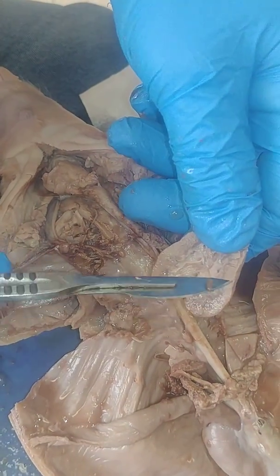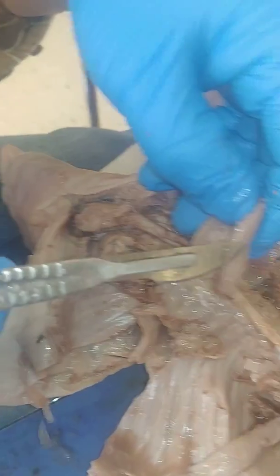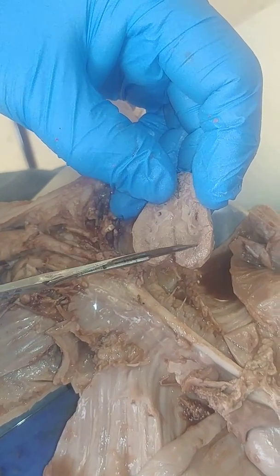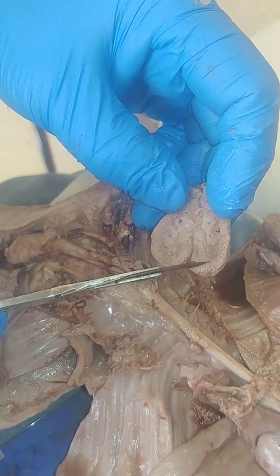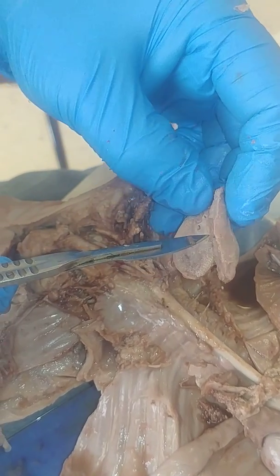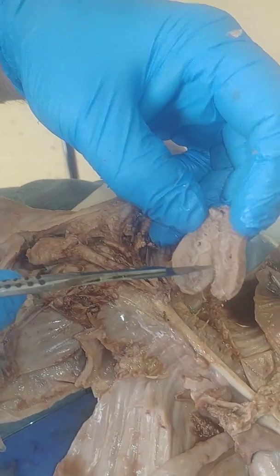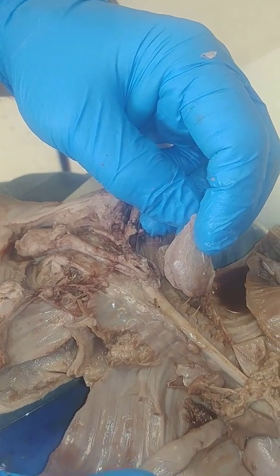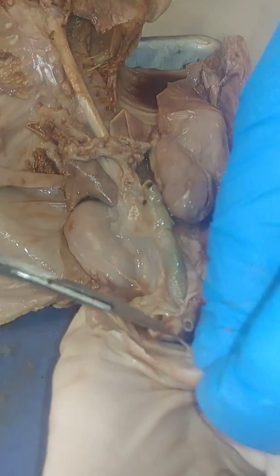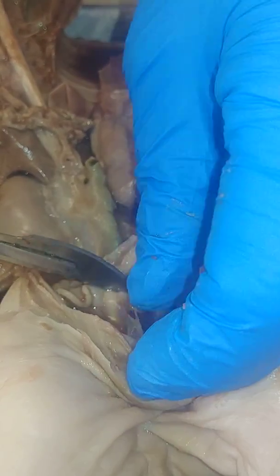Okay, so we've opened it up. So this lighter layer around here is the cortex. The little covering, there's a membrane around the outside called the capsule. And then this other layer in here, then you've got the medulla, where a lot of the filtering structures are, between these. And then this part in here, central inside area of the kidney, is the pelvis. And that's where the urine is collected, filtered out of the blood. And then that's going to travel down to the base, right in the crotch area, into a little sac that's called the urinary bladder.